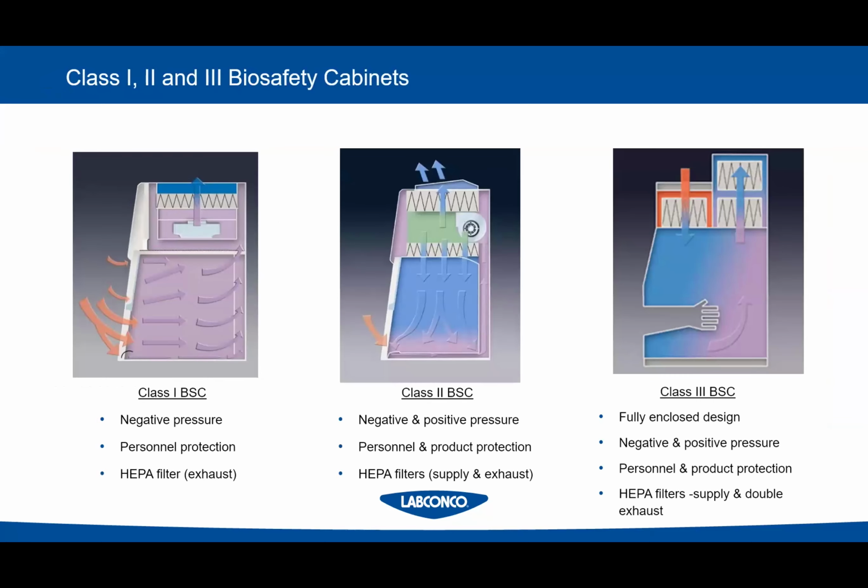All right, up next, biosafety cabinets. Now I know, did anybody in here deal with biosafety cabinets? A couple of you, okay, but not everyone. This is where I spend most of my time in the biosafety world. So I'll keep this as a simple explanation for you. But there are several types of biosafety cabinets. There's 3 classes, and then those classes, the class 2, are divided into types. So it can get kind of confusing.